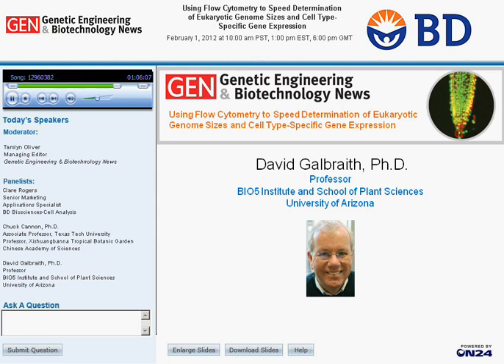Okay. All right, here's another one. You have mentioned filtering issues in mammalian cells. Doesn't the nylon mesh help in filtering? Can you suggest any specific and easy-to-use mesh filters for obtaining single cells? Yeah, I just checked online to see. In fact, you can actually buy these nylon meshes from Amazon.com. I'm not sure we're supposed to give commercials for things, but Nitex meshes. The Nitex is the type of mesh that you can buy in big rolls, and so we would buy a big roll of this and then start cutting it up with scissors and putting it on a holder. So it becomes very cheap.